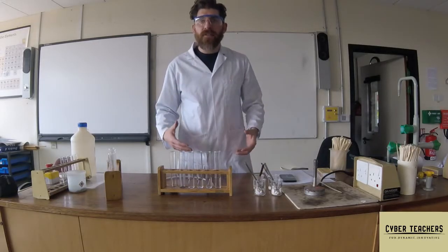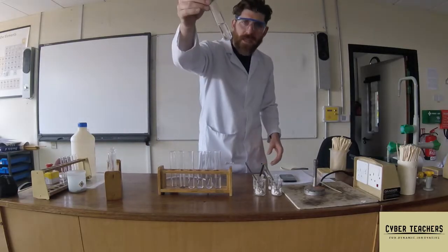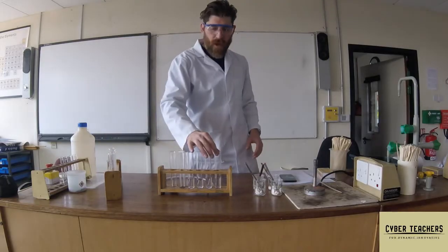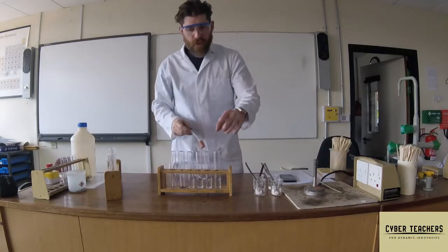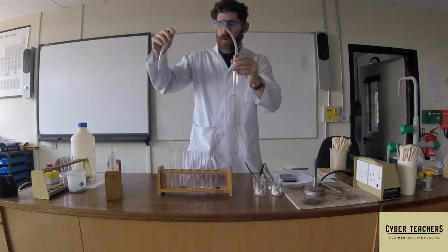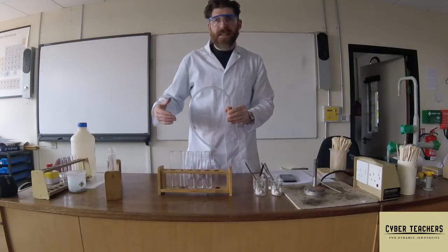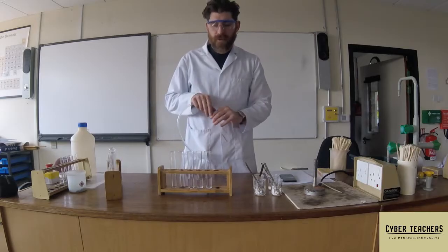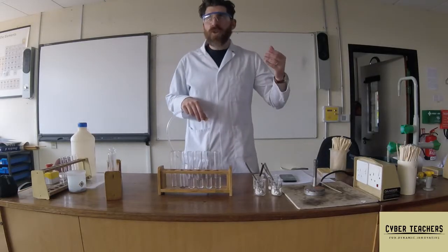A metal carbonate and an acid is going to give off a gas, so we need to test what that gas is. We've got some lime water here - nice clear stuff - and we're going to bubble the gas through it. We've got hydrochloric acid here, also clear, so don't get them mixed up. We'll add a metal carbonate to the hydrochloric acid, put a bung in with a delivery tube, and put it into the lime water so the gas can bubble through. If it turns the lime water cloudy, we know we've got carbon dioxide.